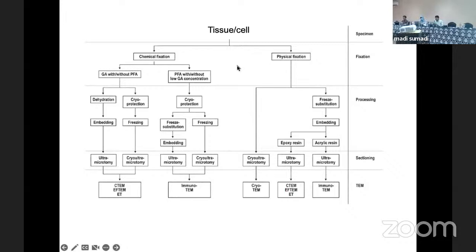It's also kind of an overview about fixation. Anything that you see is fixed. It's exactly like I told you before: fixation could also alter the structure and properties of the cell, which is also proven. But we do not have any alternative. Anything, either staining or dissection or anything, goes with fixation. So what is fixation? How does it work?